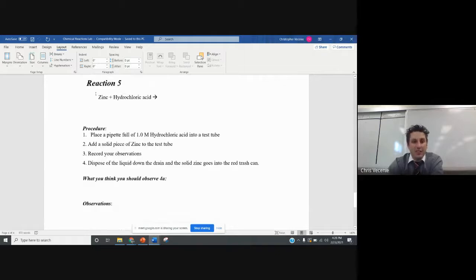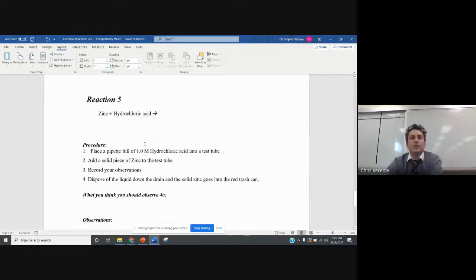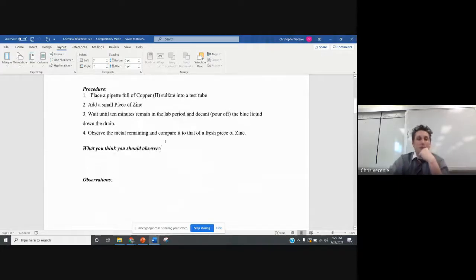And then lastly, 5, the zinc plus the hydrochloric acid. Friendly reminder there, hydro-ic acids used to be ide enders. So hydrochloric acid used to be hydrogen chloride. So you do all your predictions. Then you're going to go back. You're going to watch me conduct the experiment. You're going to make observations.